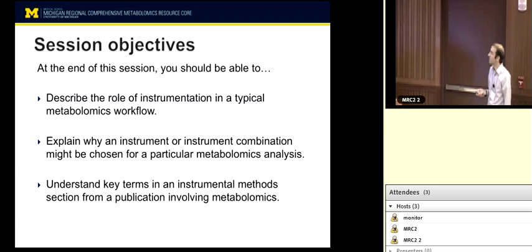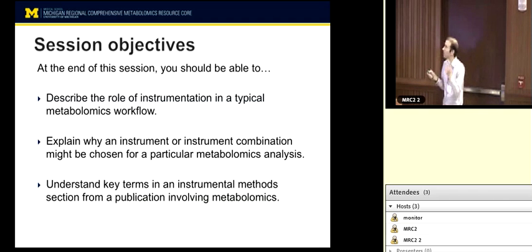So now let's talk more about mass spectrometry. Okay, so NMR versus mass spec. Okay, one more slide, sorry. So high sensitivity, this covers much of what I already said. Mass spec is a little bit better for sensitivity. Quantitative reproducibility, NMR is great. Mass spec can be good or bad depending on how you manage it. Mass spec does a little bit better with many analytes simultaneously, although NMR can handle quite a few. Generally high, close to 100 maybe, over 1,000. Structural information, NMR is great. Mass spec can be good depending.